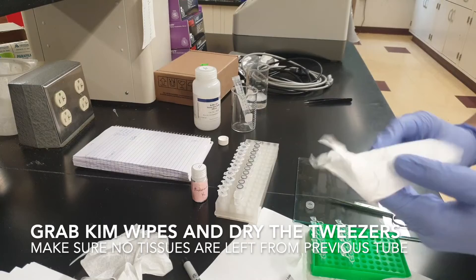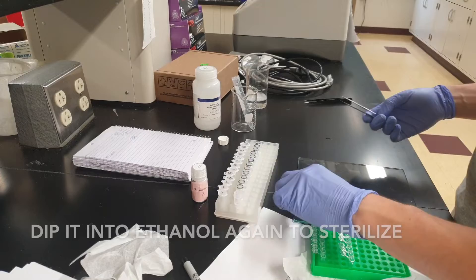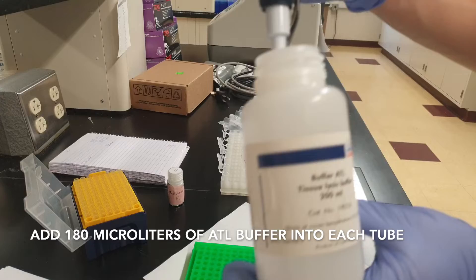Before moving to the next tissue, dip your tweezers into micro-solution, use a chemtech wipe to clean any excess tissues that might be left from the previous tube, then dip into ethanol to sterilize. Repeat the process for the rest of your tissues.